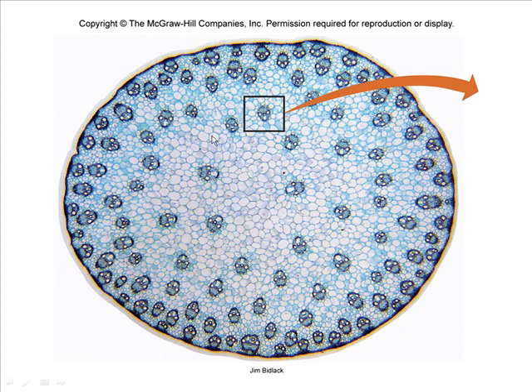What's all this area in here? What kind of tissue is that? Parenchyma. What do we call it positionally? Ground tissue, developed from the ground meristem. How come we don't say it's cortex or pith? Well, they're not evenly distributed, but still, there's a little less toward the middle, but you can't identify an outer or inner region exactly. So there's no cortex and pith. It's just all called ground tissue.